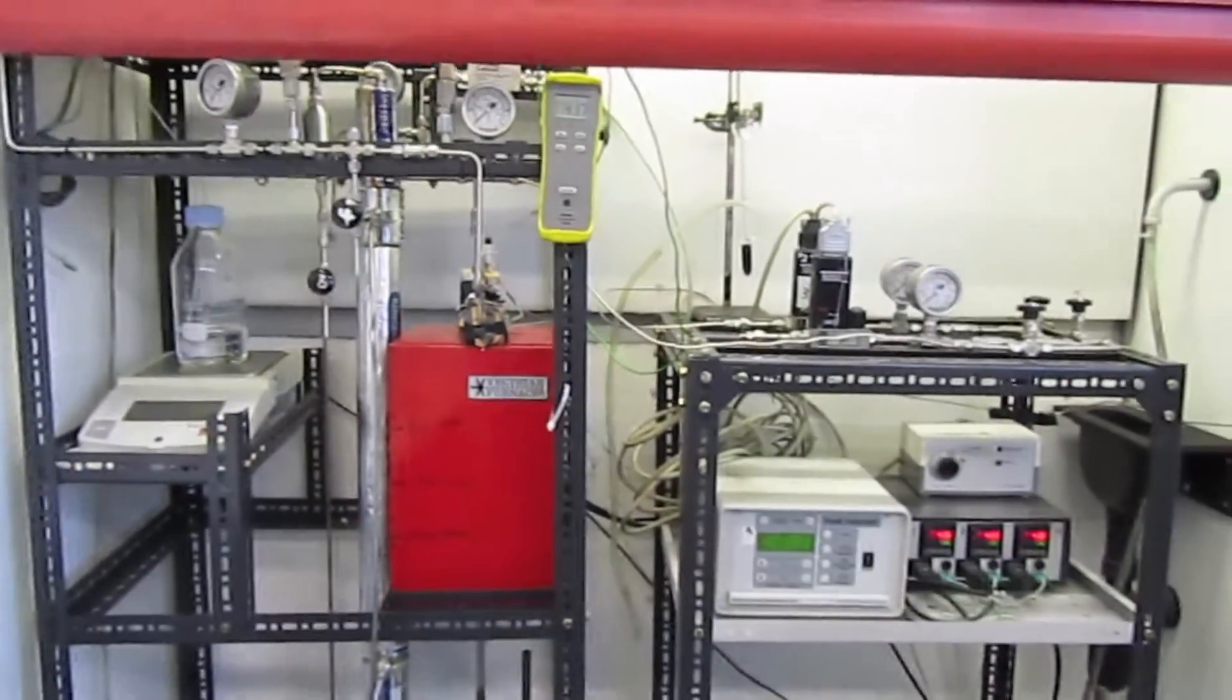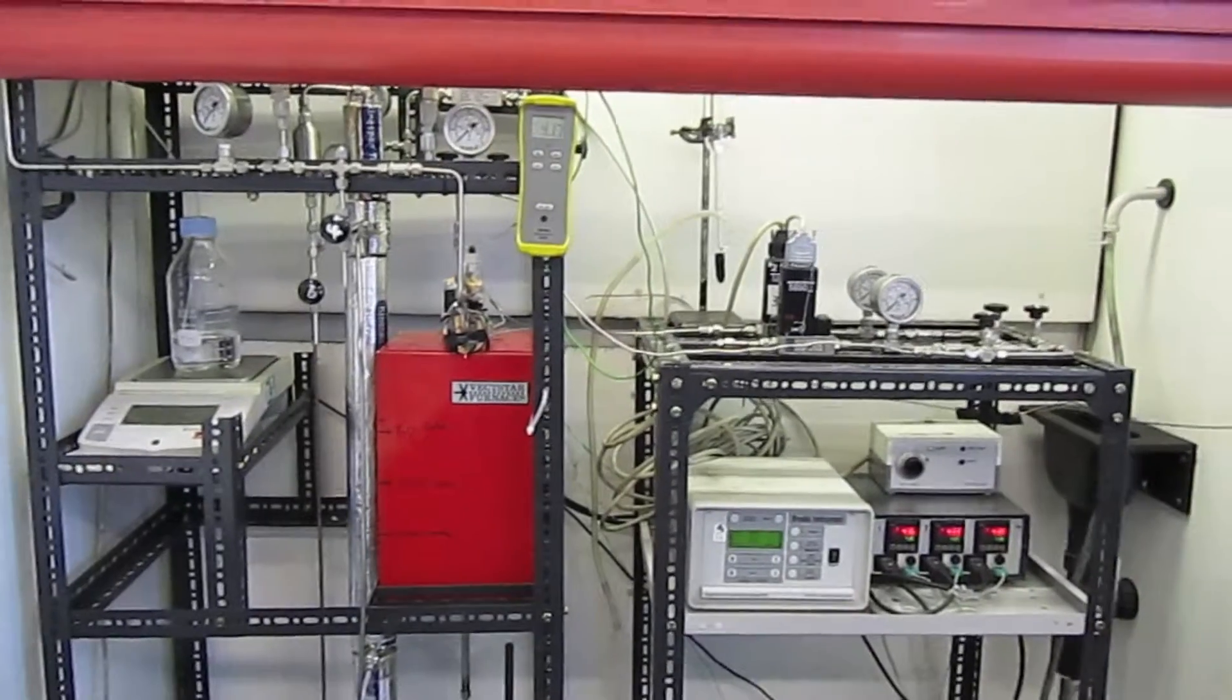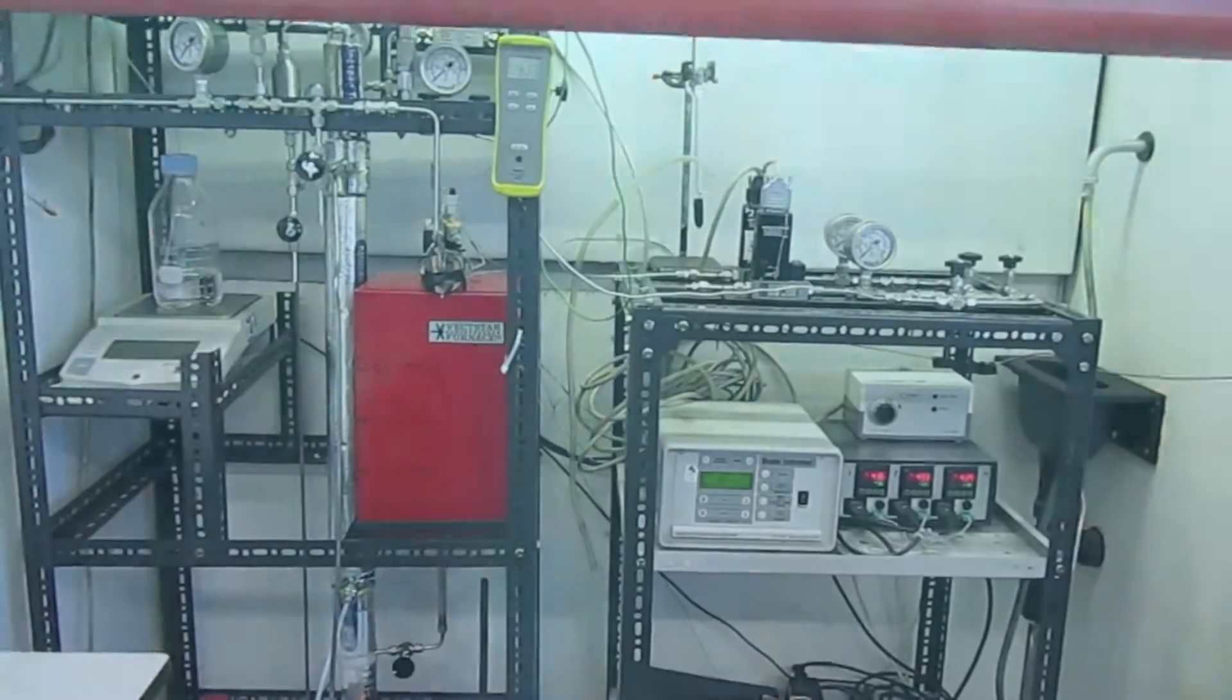This concludes the short recording of the catalytic reactor rig available in the laboratories.